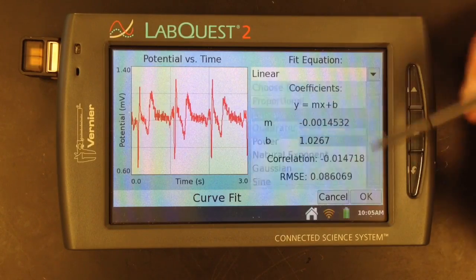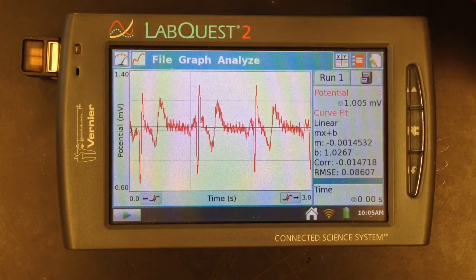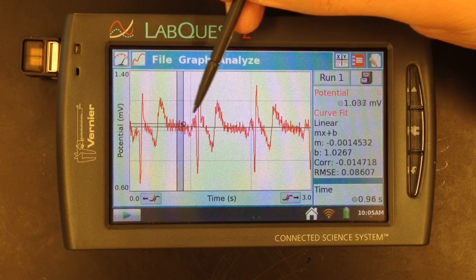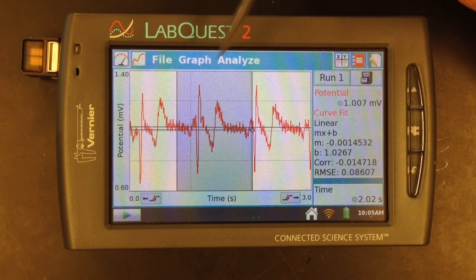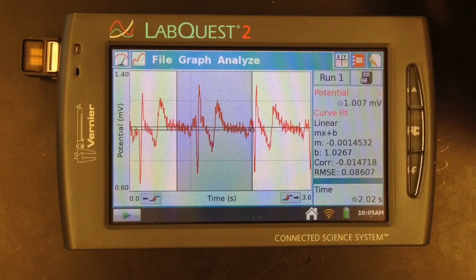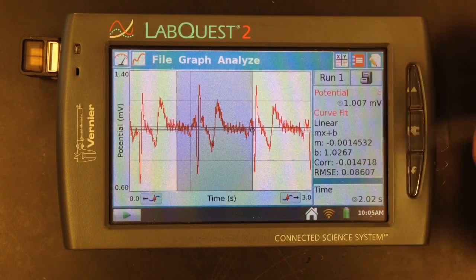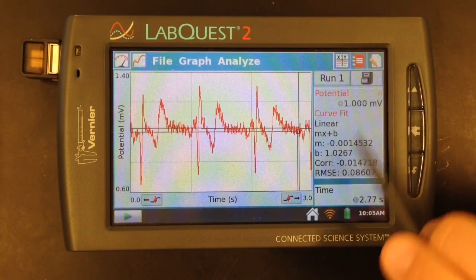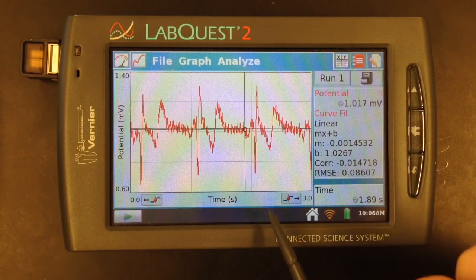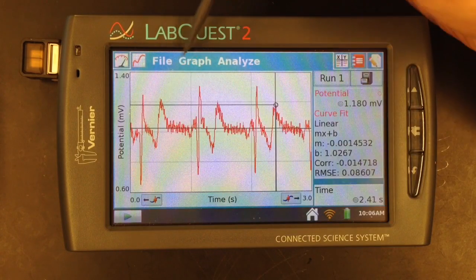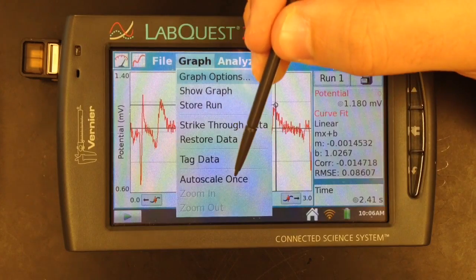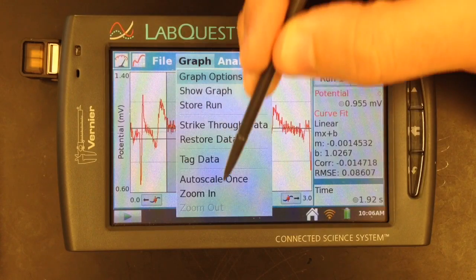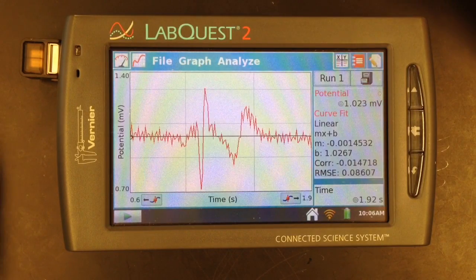Let's try a linear curve fit so you can see what it looks like. For both the curve fit and the statistics options, if you press and drag, you'll see that you've highlighted a small selection, and then the statistics or fit will only apply to those sections. In addition, just tapping around the graph, you can see that the value changes based on where in the graph you've selected. You can also zoom — either auto-zoom based on what the LabQuest thinks you'd want to see, or if you make a selection, you can zoom in to just the part you are actually interested in.